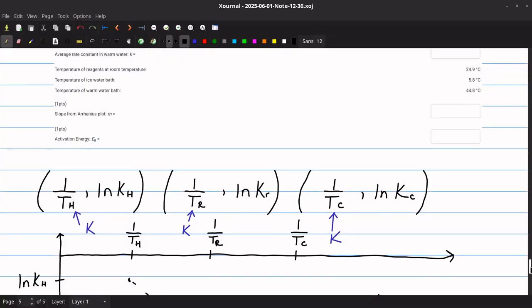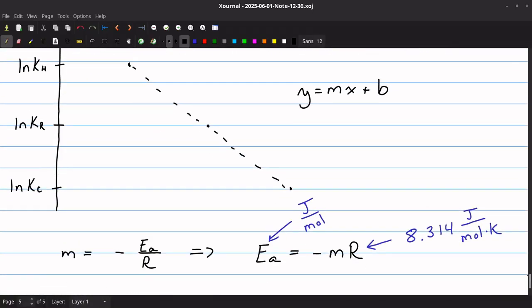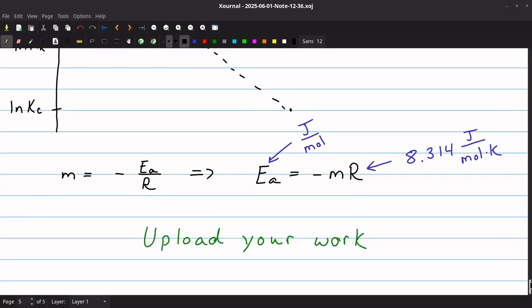You can kind of tell that if you look at the equation here a little bit, because it needs to be multiplied by X, which is 1 over Kelvin, and then it's going to become unitless, which is kind of necessary because B is a natural log and Y is a natural log. And that's going to give us the activation energy in joules per mole.